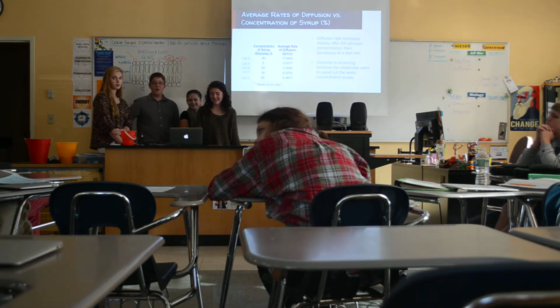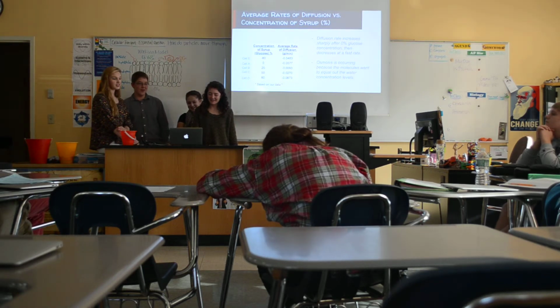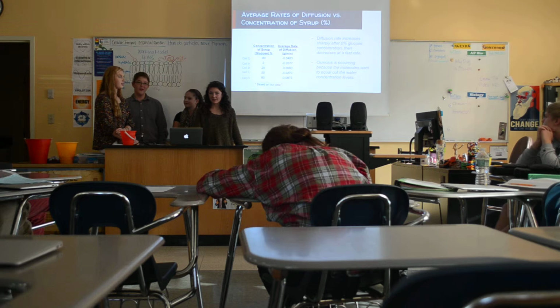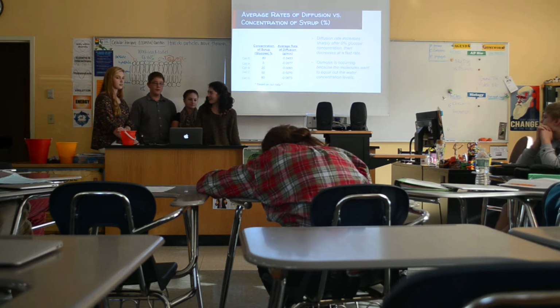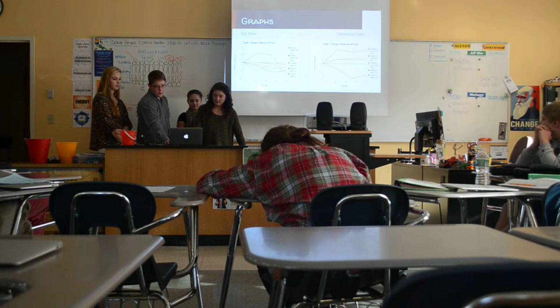Okay, yeah, I'm gonna throw up. They're all negative? Yeah, so that was our data. I think we did something wrong. Yeah, our data was very off because a lot of the cells leaked. But go back to the one graph before that, because the graph before that doesn't show that you have all negatives. Oh, yes, it does. Oh.